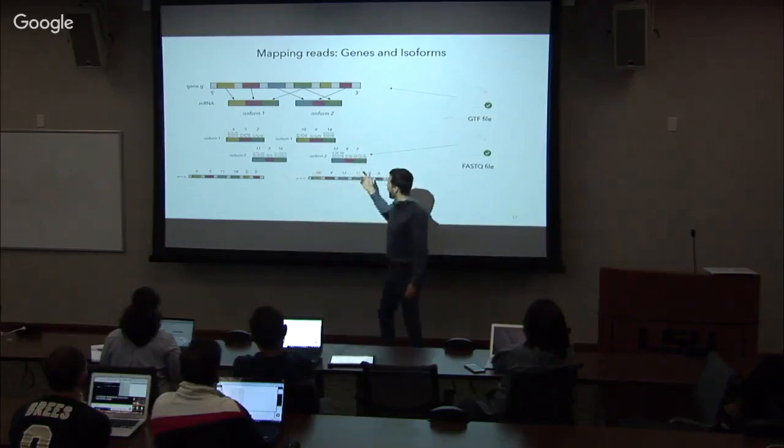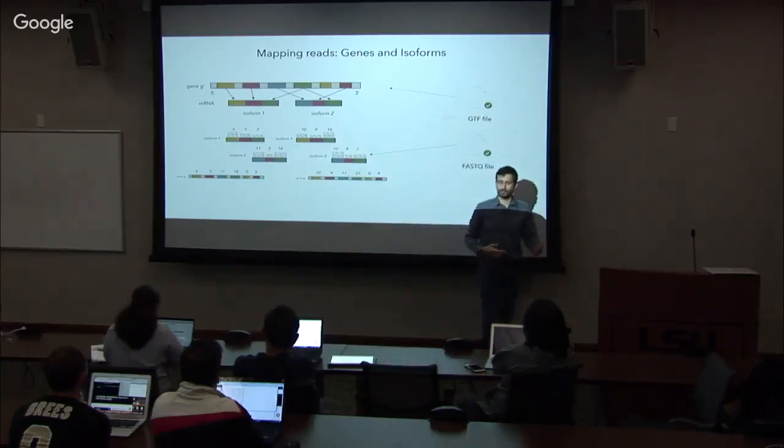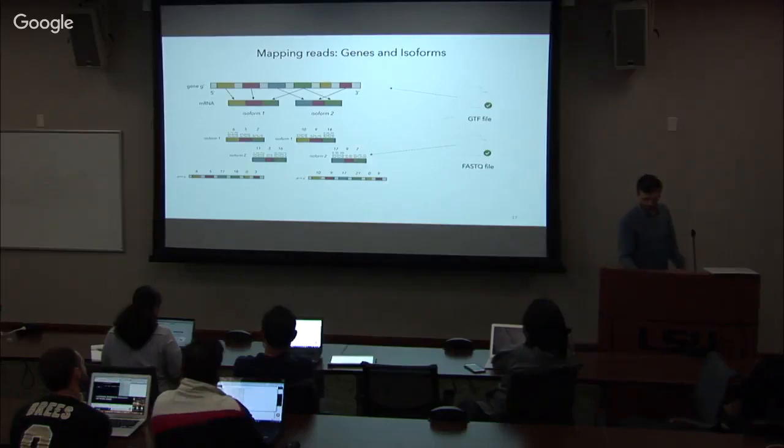And then we have 2 different conditions, for example. And now we want to try to understand how does one condition differ from another condition by comparing the number of reads aligned to this gene, right? So that is the objective.